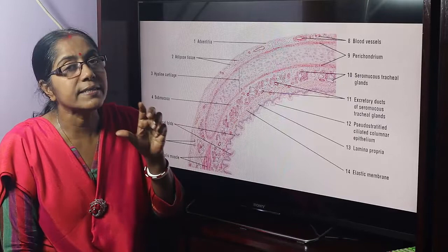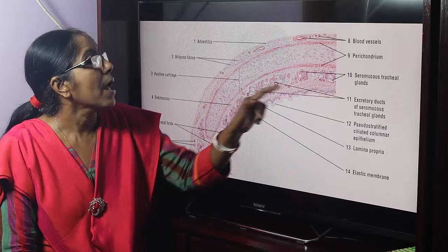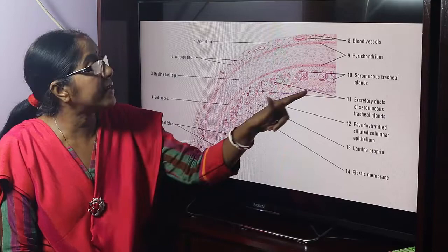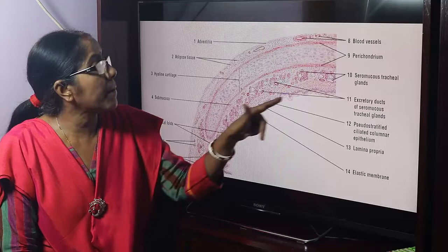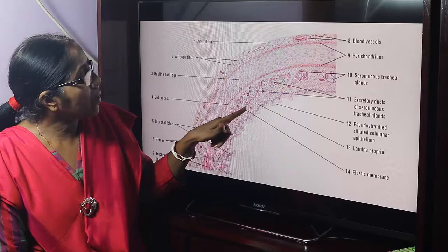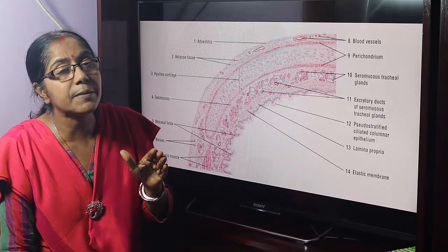The connective tissue is highly vascular, containing arteries and venules. These are the seromucous tracheal glands with visible lumens. The mucosa has a dual layer: lining epithelium and lamina propria. These goblet cells are unicellular glands, and the submucosa contains seromucous glands. This is the elastic membrane — its function is to separate the mucosa from the submucosa.